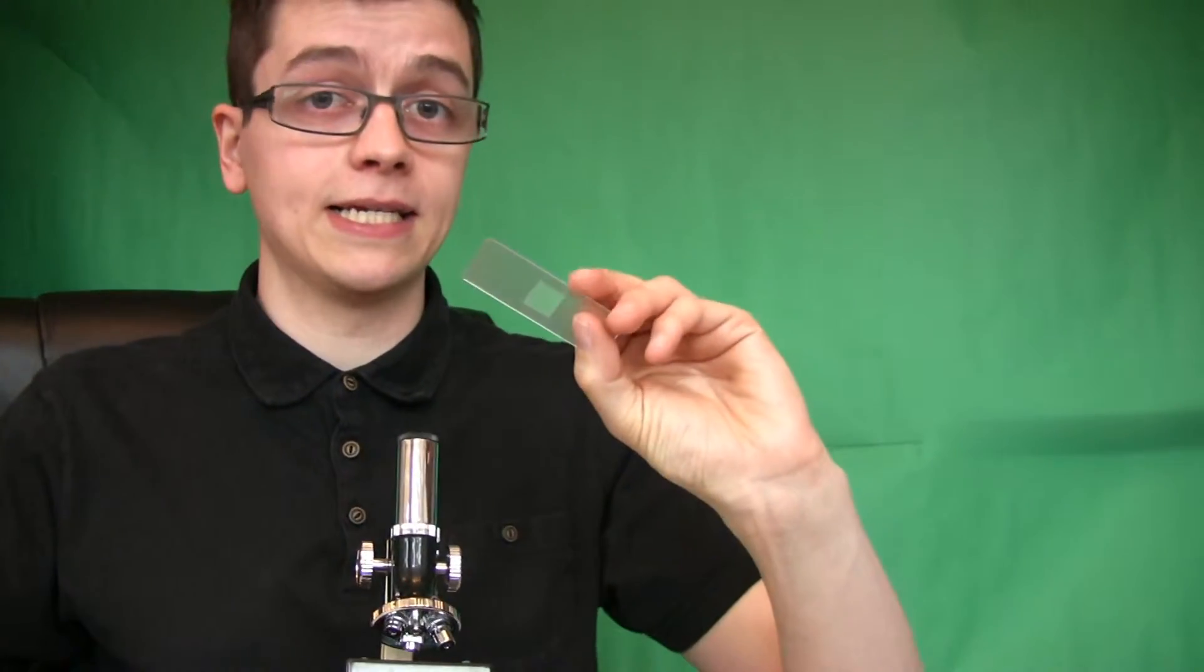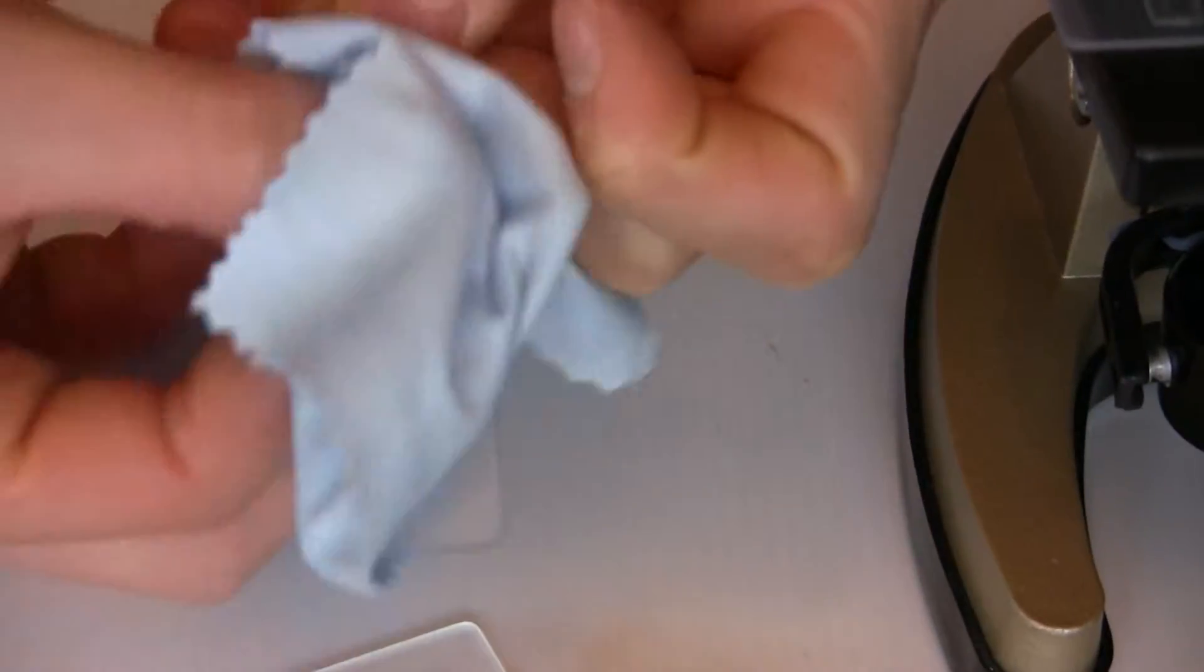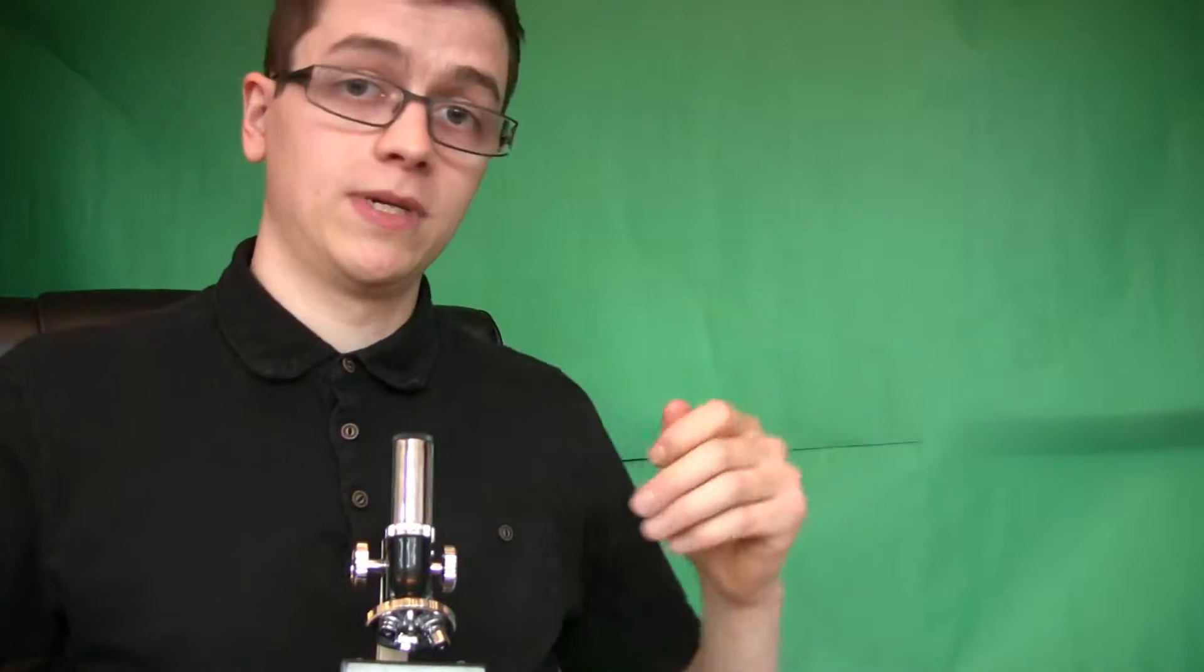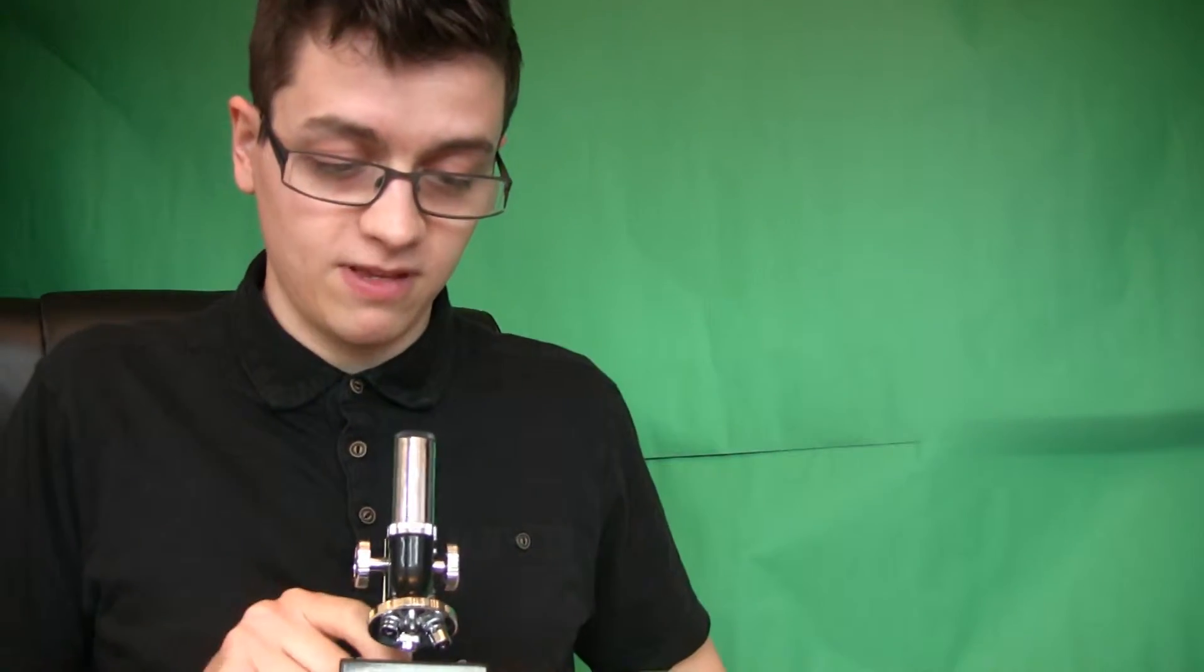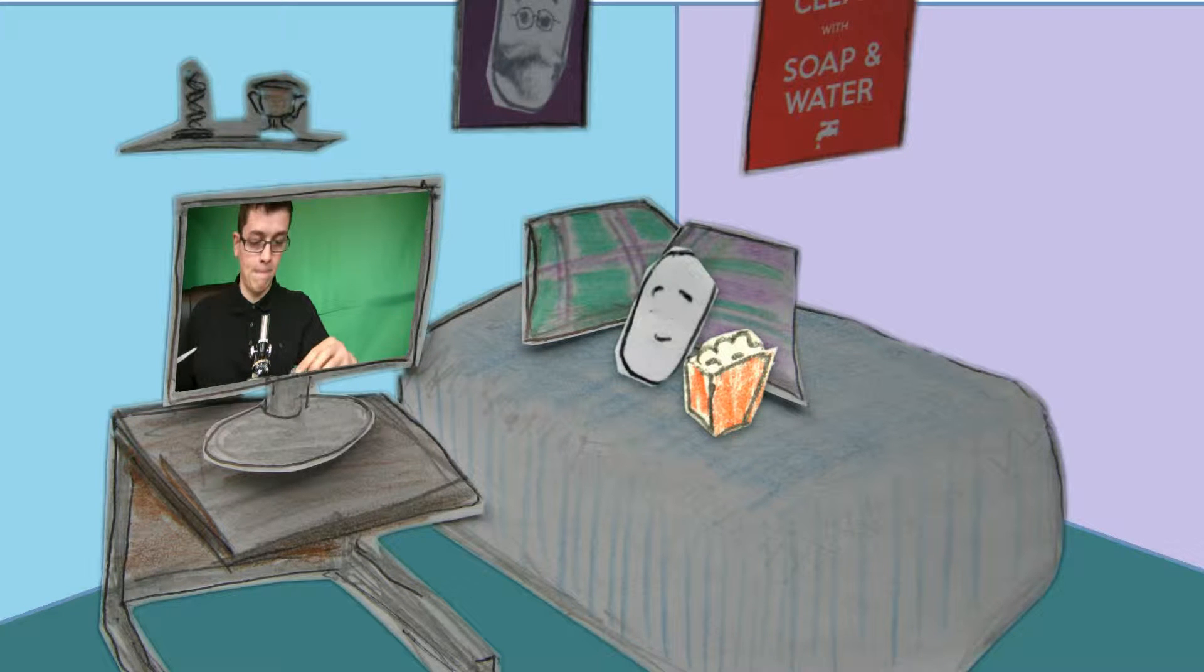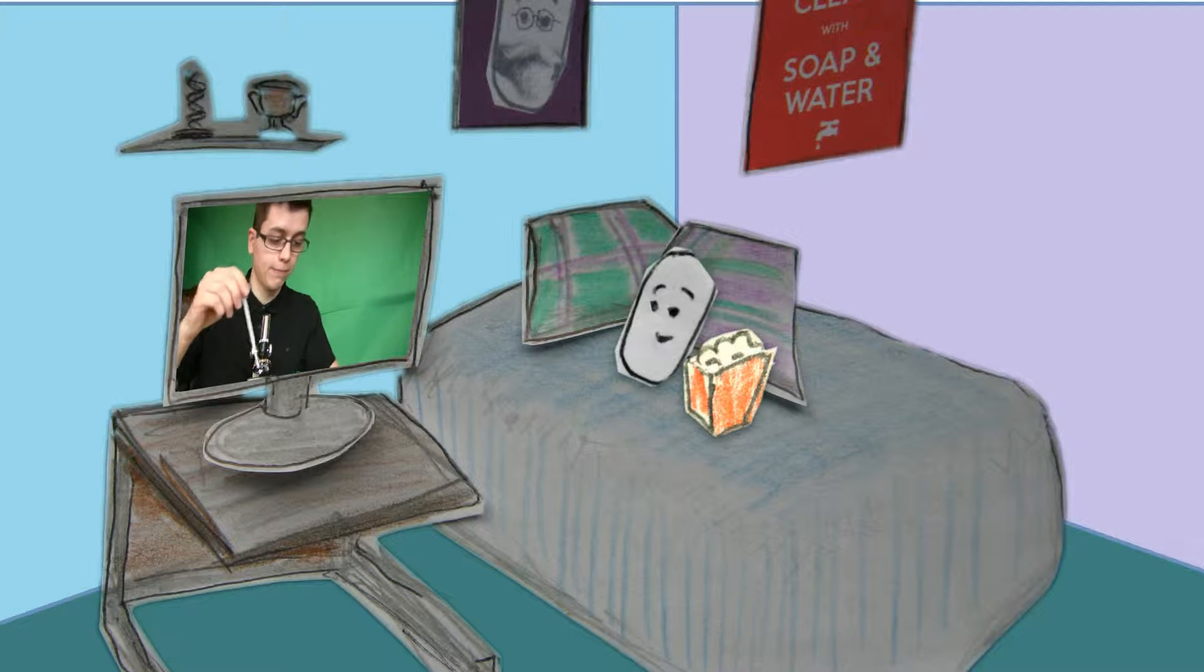So to start with, I need some clean slides. Just going to make sure they're beautifully clean, because obviously any bits of dust or anything on the slide will show up under the microscope. And we're not here to look at dust, we're here to look at stuff from the pond. He makes a good point.